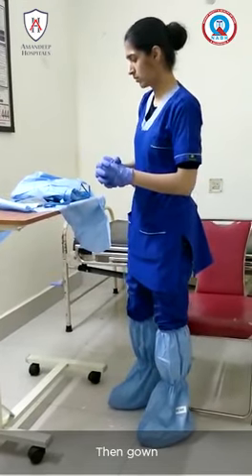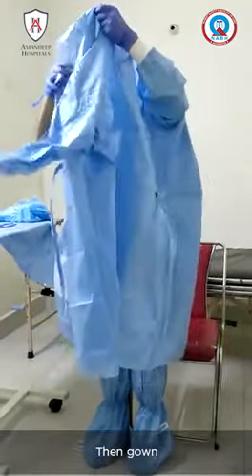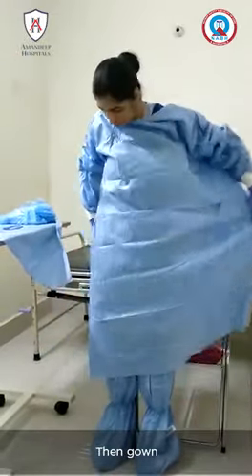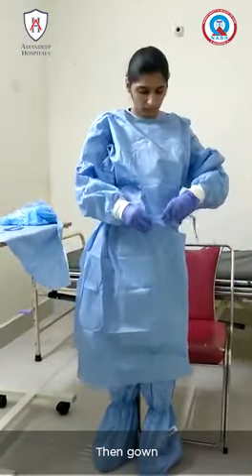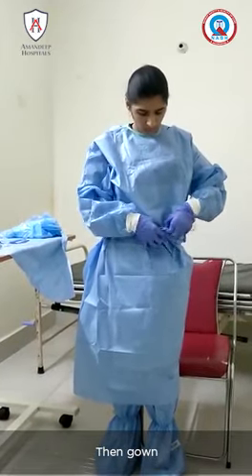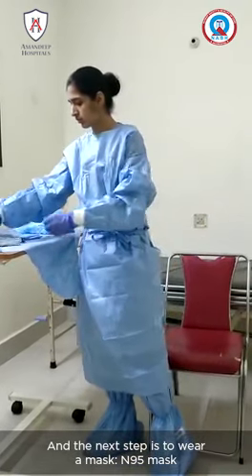Then we put on the gown. The next step is to wear a mask — an N95 mask.